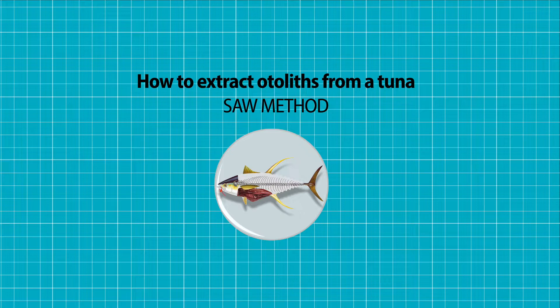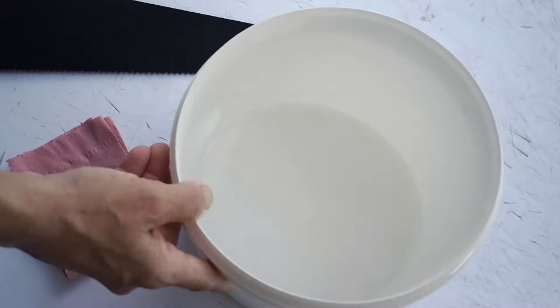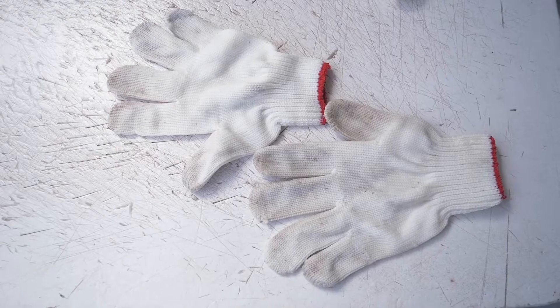Today, we're going to learn how to extract the otolith from a tuna, cutting the top of the head of the fish using a saw. We're going to need a saw, tweezers, a vial, labels, absorbent paper or a piece of cloth, water, and some gloves if you need them.